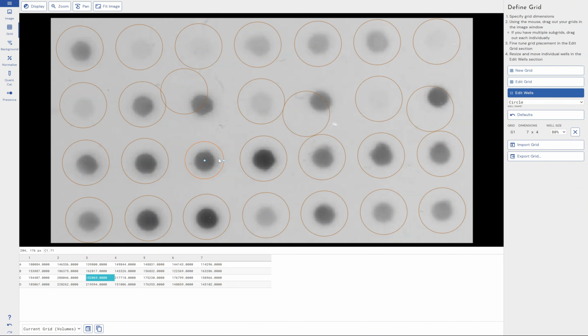So if you are someone that's used Array before, currently using it, trying it out, and you're watching this video as a bit of a demo to try and learn its features, that's one piece of advice I would give you: always go bigger than you think you need to, because the background subtraction is going to sort that out for you anyway. Don't go super tight to your data, because you're probably going to cut off some of your own data by doing that. And that might be the difference between a positive and a negative result.